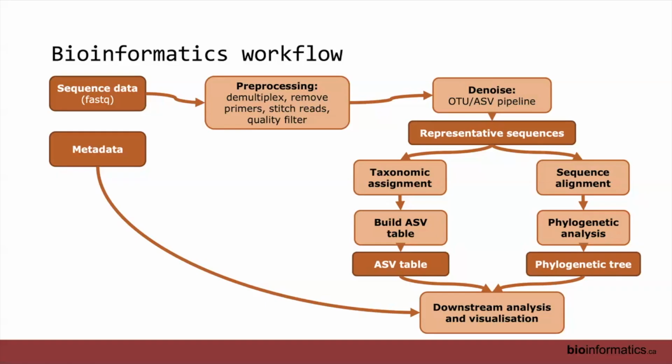And at that point, with those sequences, we can do a couple of different things. We often are looking to do taxonomic assignments, and from that, we will usually then build an ASV table. Once we have that, we can do downstream analysis and statistics and visualization. The second thing that we often do with those sequences is we align them, and we're often wanting to build something like a phylogenetic tree with them. We're not going to be doing that today, but you will be doing some of that tomorrow morning.